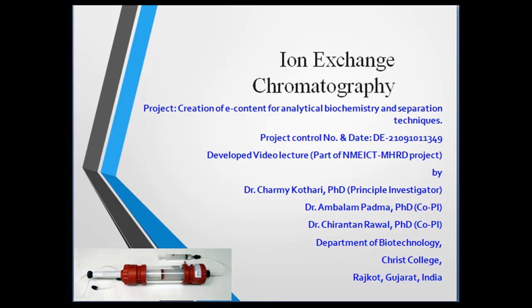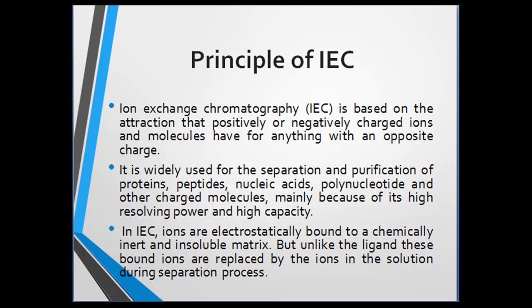Ion exchange chromatography is based on the principle of attraction between oppositely charged molecules. It is a widely used technique for separation and purification of proteins, peptides, nucleic acids, polynucleotides and other charged molecules, mainly because of its high resolving power and high capacity. In ion exchange chromatography, ions are electrostatically bound to a chemically inert and insoluble matrix.